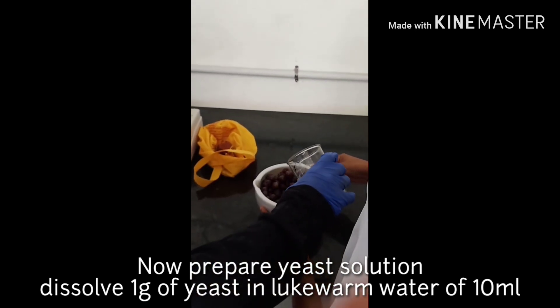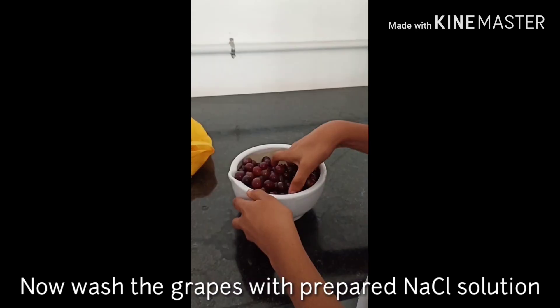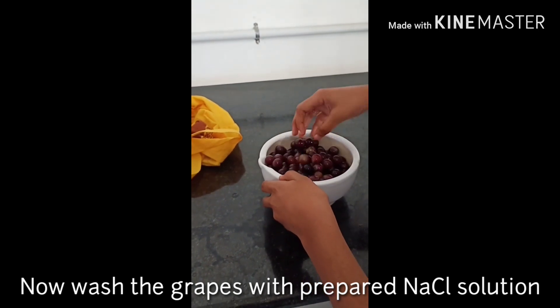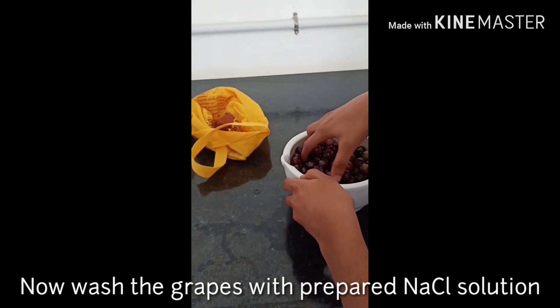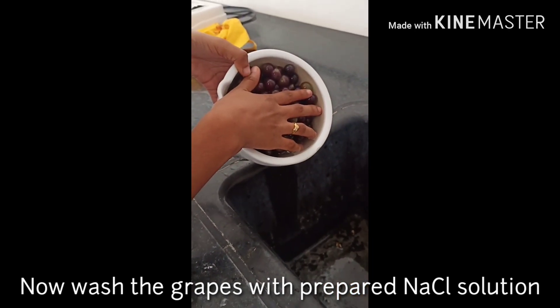Simultaneously, we prepare a yeast solution. We take one gram of yeast and add it to 10 ml of water. We use lukewarm water to activate the yeast, making it go from inactive to active form.